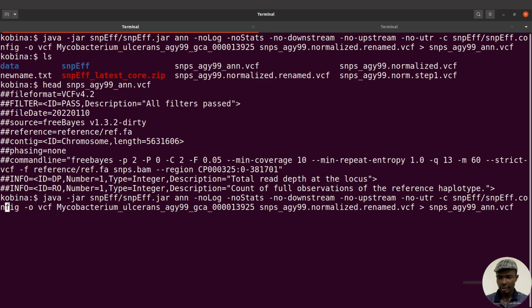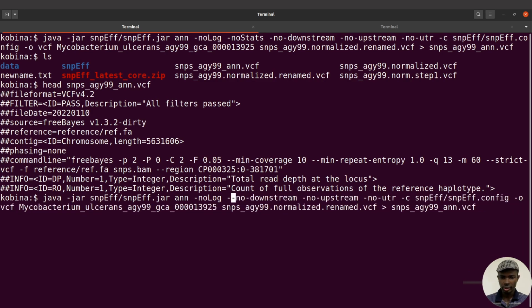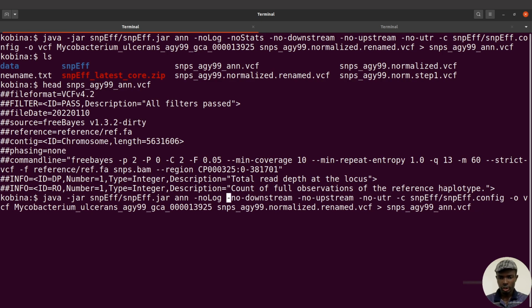So you can do that here. So I'll just do this and remove it. So if I remove it, let's run snpEff again, and let's see what comes up. So I'll do that again, and then you will wait for everything to get done for us.